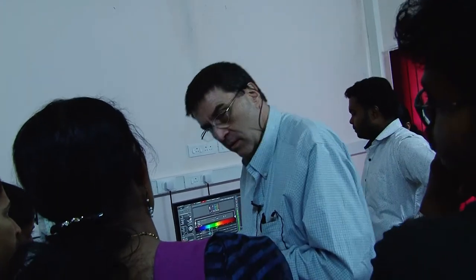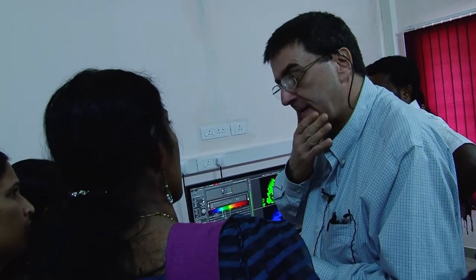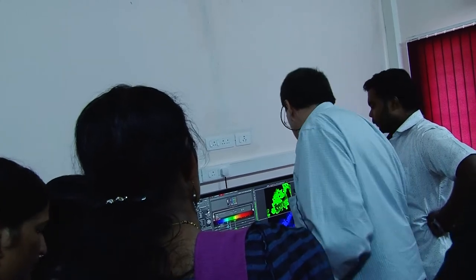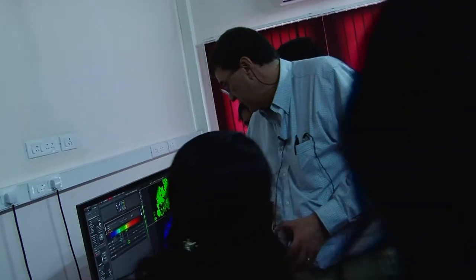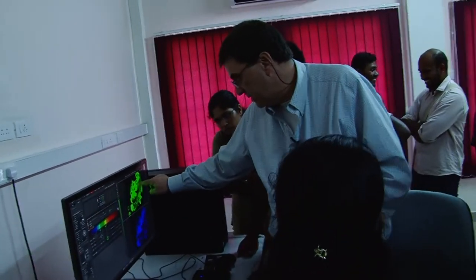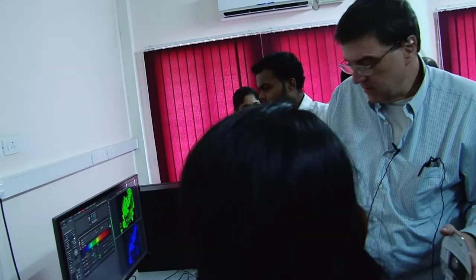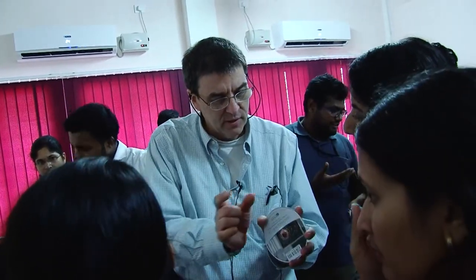So the option is to get another dye, right? Probably. Yeah, these two just don't work. Because see how, even though we're trying, but see how the bubbles interfere, but see how the pattern's the same? Because you can't spectrally pull the two apart because they're both exciting at the same time. And they're close enough that they're just bleeding into each other.